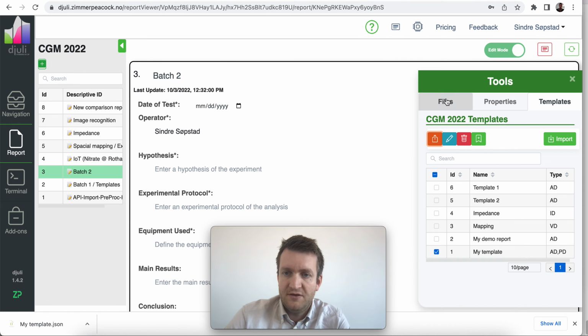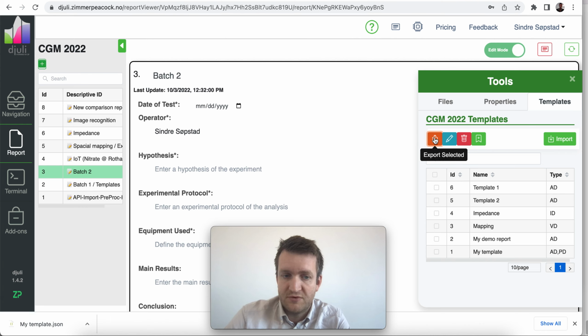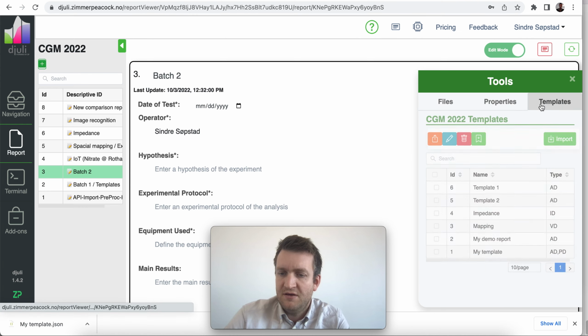The way I apply it again is that I import a report. That's going to open a tab to upload this template and put it back into my list, and I rename it, all that. And I can also delete stuff like so. That's removed my template.